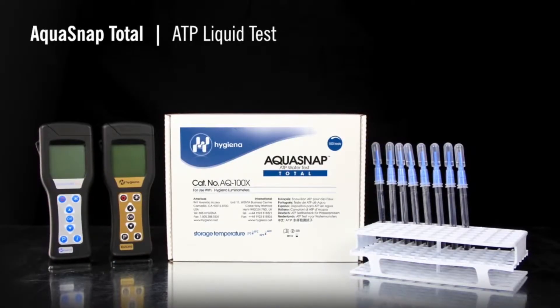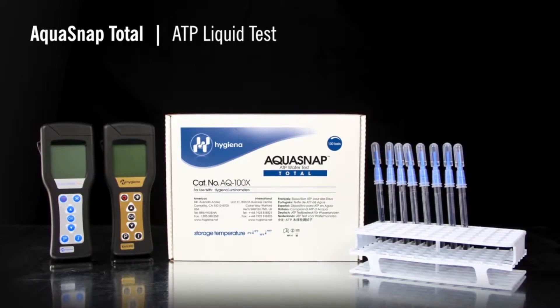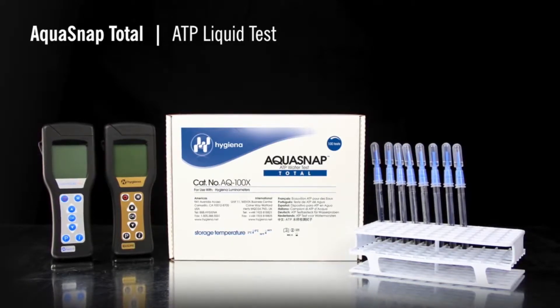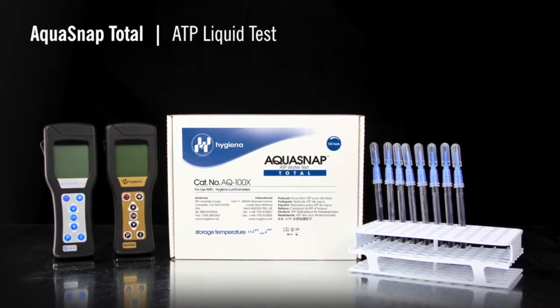AquaSnap detects both organic and microbial contamination. It is often used as a tool for the management of water systems, such as cooling towers or clean-in-place systems.